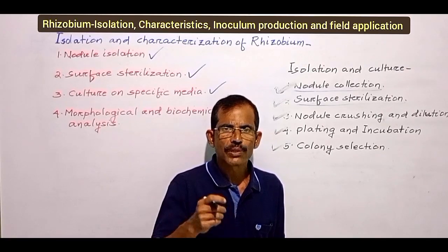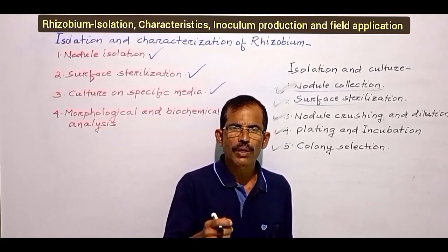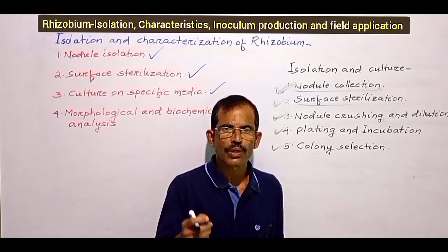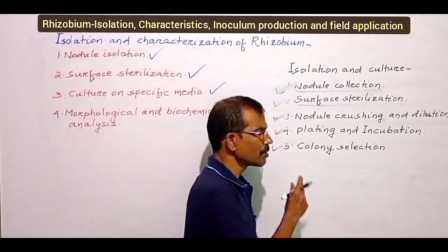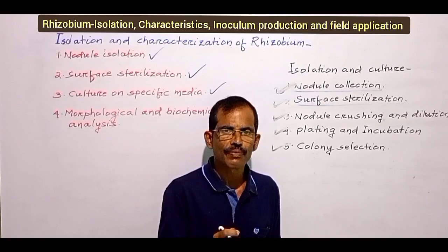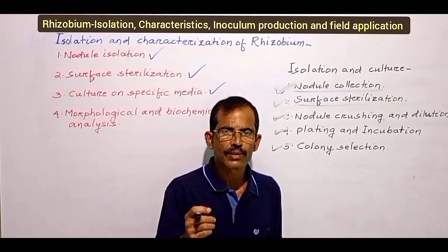As a result of this incubation, there will be numerous rhizobial colonies on the nutrient medium from which suitable colonies are selected for identification and characterization.